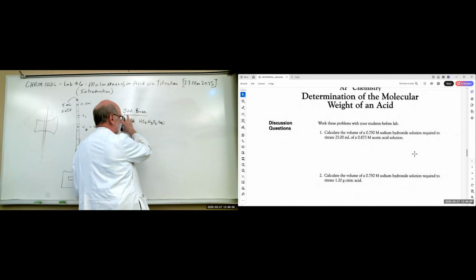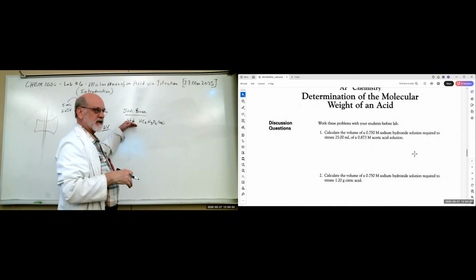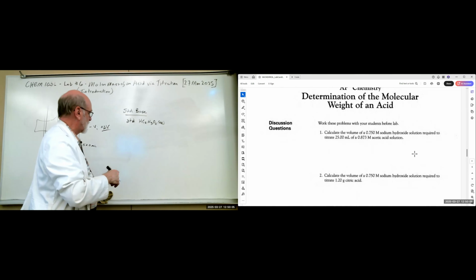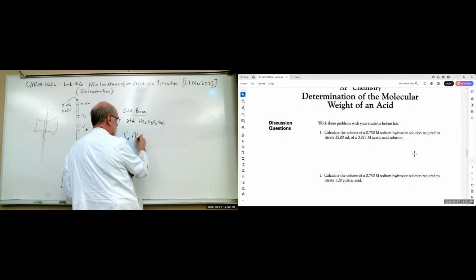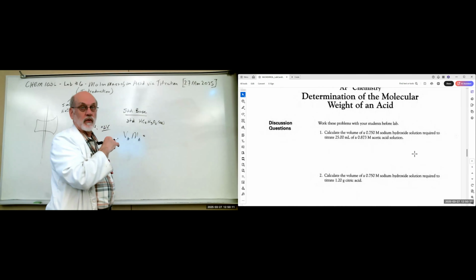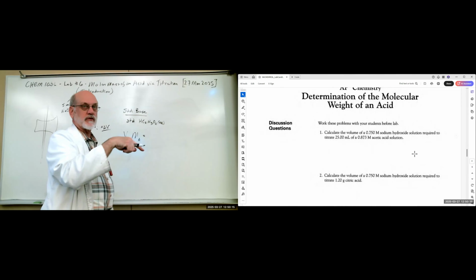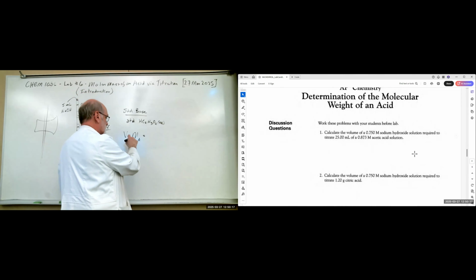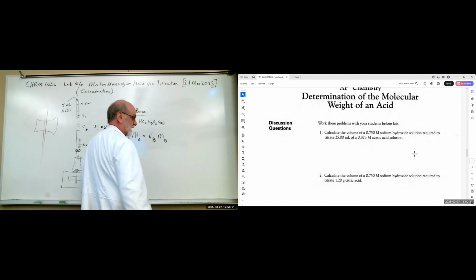So you have an absolute amount, a standardized value here. So you measure out a certain volume of this into your container. And if you have the volume of the acid and we know what the molarity is, we can find out the number of moles. And since there's one proton here and one hydroxyl for the base, then we can use this relationship. Like that.